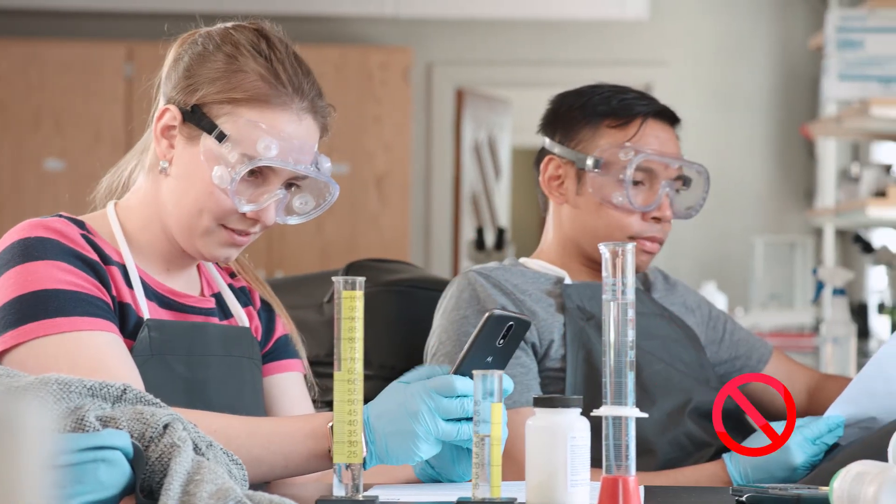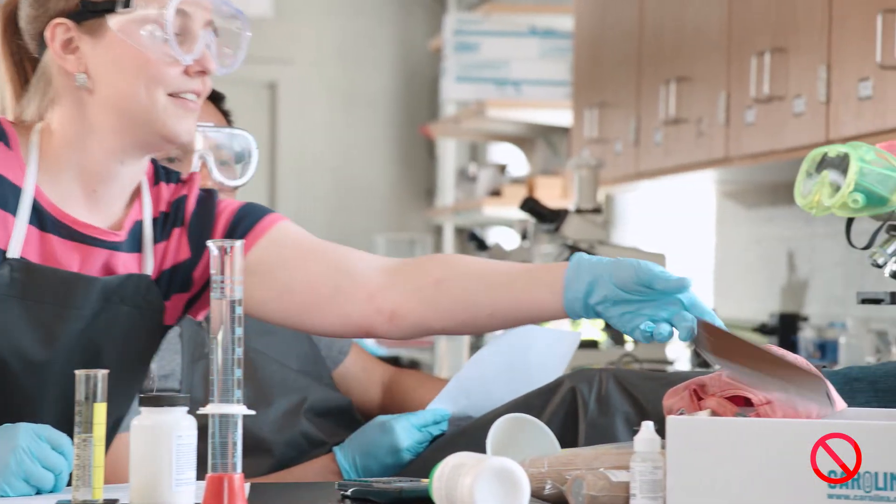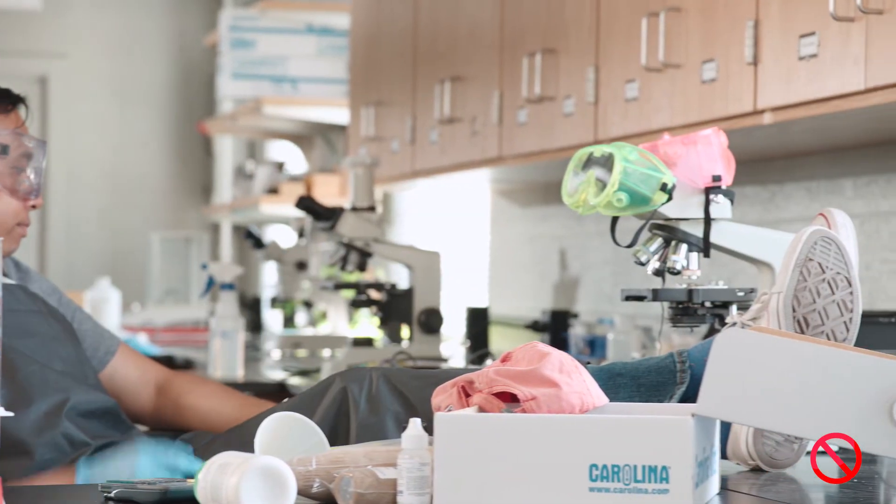Keep work areas tidy, keep aisles and exits clear, and move backpacks, jackets, and other personal items out of the way of lab work.